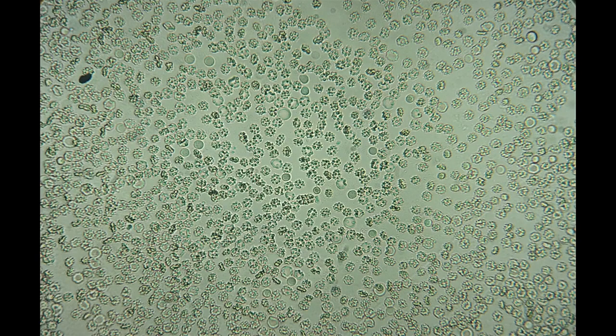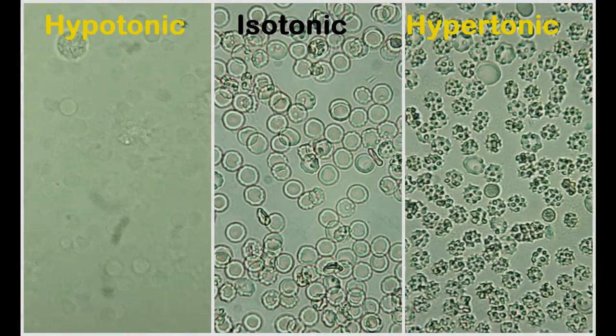In the slide containing the hypertonic solution, RBCs shrink in size and exhibit a phenomenon known as RBC crenation, wherein the cells exhibit spiky appearance on their surfaces. This simple demonstration shows the effect of solutions of varying solute concentration on cells.